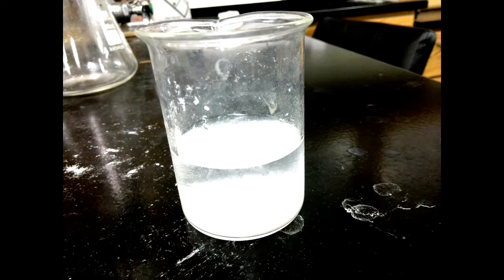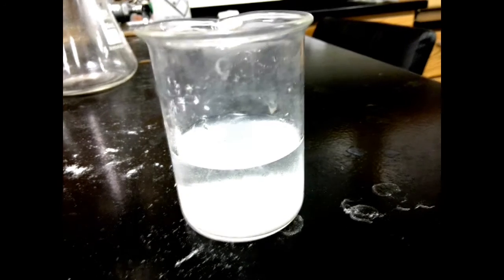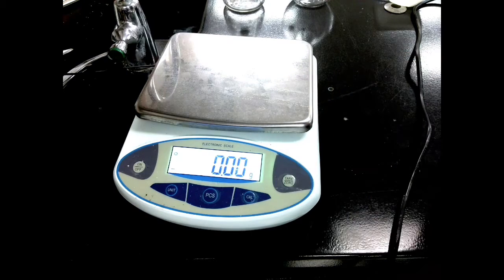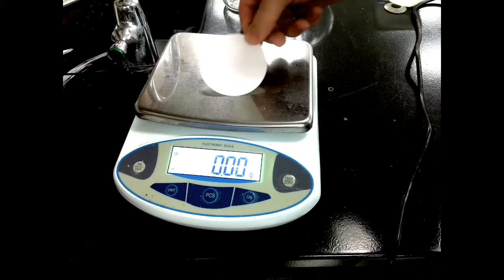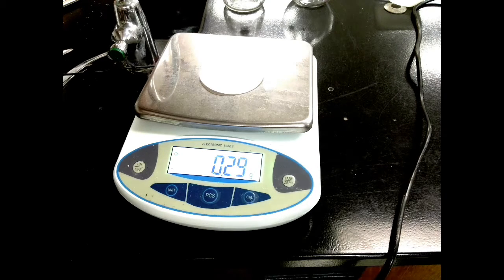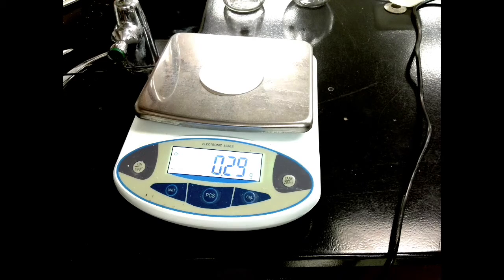But when we weigh our final product, we're going to be weighing it on the filter paper. So we're going to need to subtract the weight of that. So before we do anything else, we need to weigh our filter paper. So first we need to reset our scale. We put our filter paper on top of it. And it's about 0.3 grams. So we're going to write that down. We're going to write down that we have 0.3 grams for our filter paper.